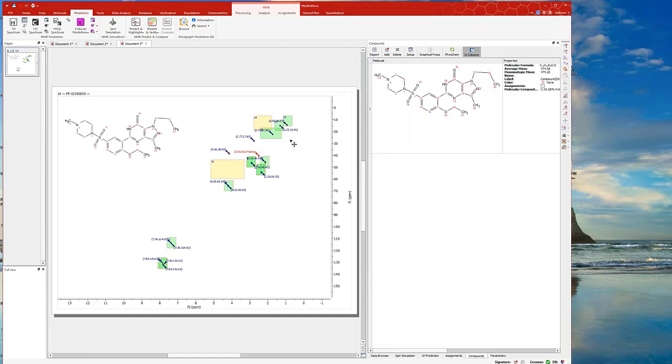Right, so from here you can see there are two rectangles that don't have an experimental peak within them. So they are displayed in yellow as a warning. You can see they correspond to 31 here and 30, actually this one, the methyl group. This gives you a rough idea that this structure is not so compatible with the HSQC, and the reason is those expected regions are not matching the experimental observation.